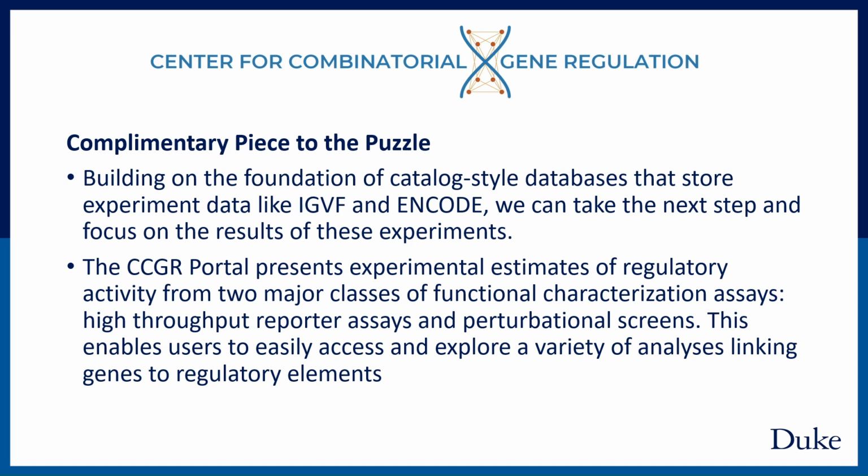We view the portal as a complementary piece to the puzzle. Building on the foundation of catalog-style databases that store experiment data like IGVF and ENCODE, the portal can take the next step and focus on the results of these experiments. We pull experiments from two major classes of functional characterization assays, high-throughput reporter assays and perturbational screens. This enables users to easily access and explore a variety of analysis linking genes to regulatory elements.